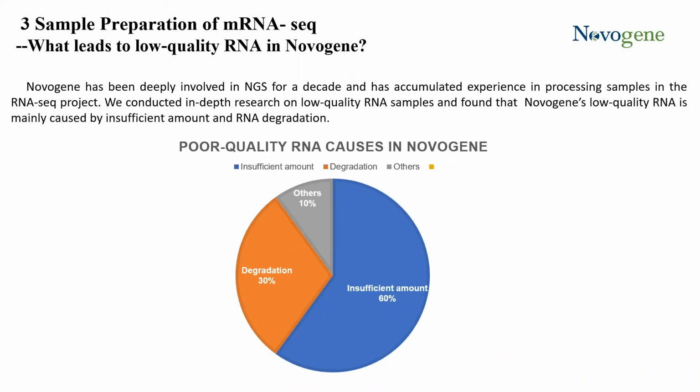Also, I would like to make a note here: any sample that is evaluated as hold, in our experience, even though it's evaluated as hold because our QC criteria and QC metrics are pretty stringent, can still yield a good library preparation success rate of about 98%. And in general, the data quality of this hold sample is enough for analysis in most projects.